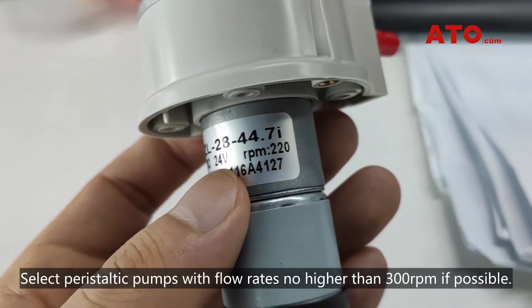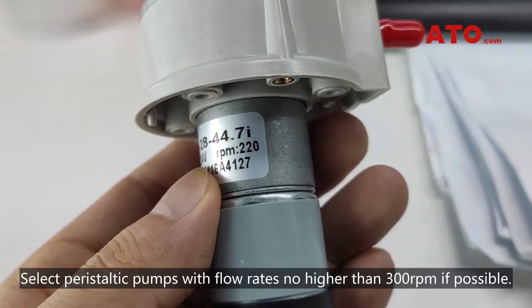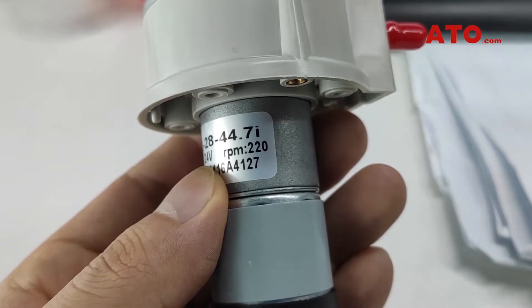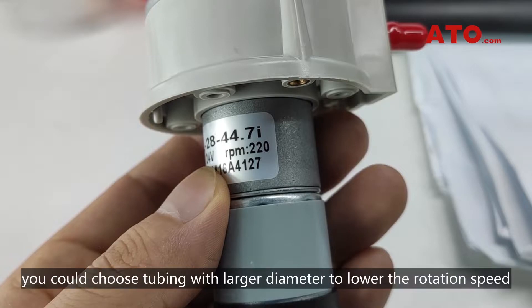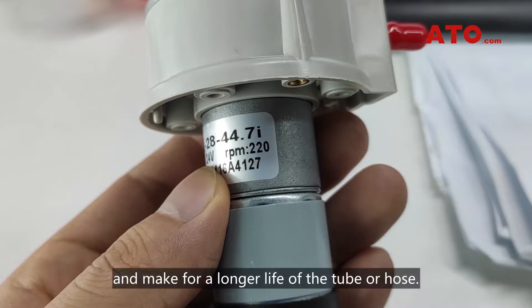Select peristaltic pumps with flow rates no higher than 300 rpm if possible. As the peristaltic pump generates flow rates from rotating rollers, you could choose tubing with a larger diameter to lower the rotation speed and make for a longer life of the tube or hose.